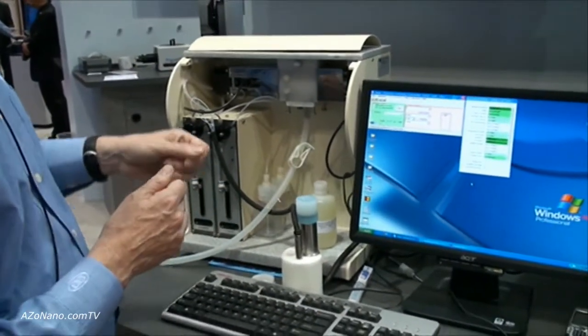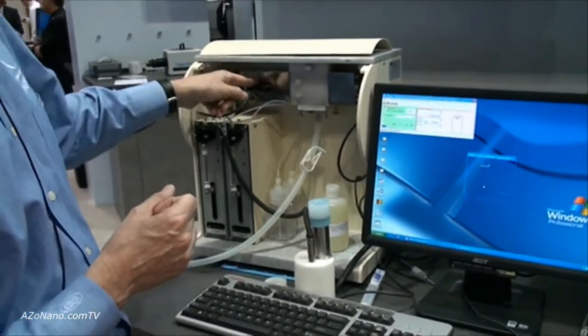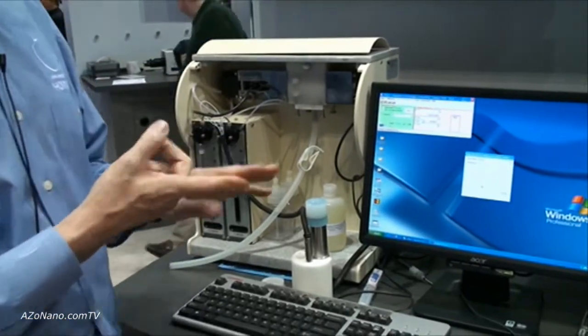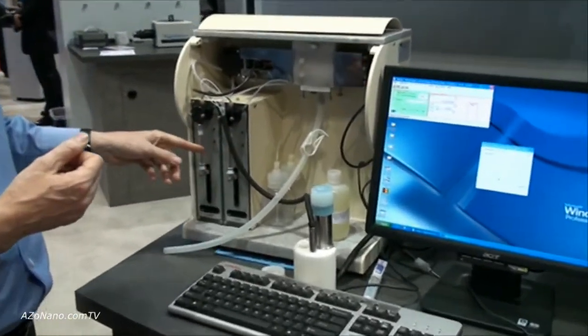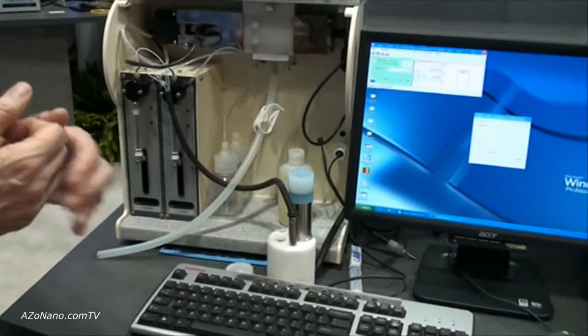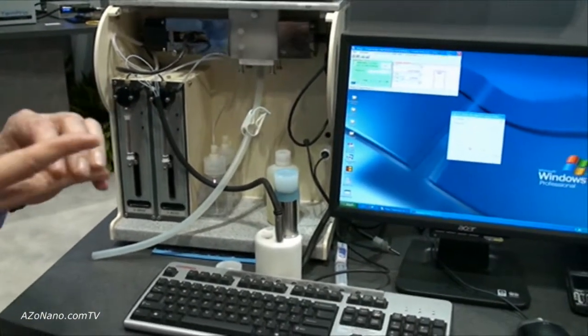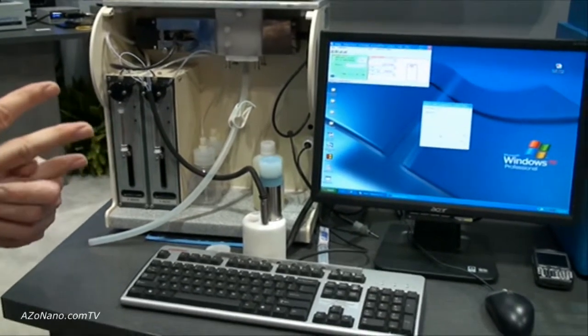This is set up to do a particle size distribution. So this is going to do particle size followed by zeta potential and what you see here also is we could perform a titration looking at the change in zeta potential and particle size as a function of a change in pH or surfactant concentration.